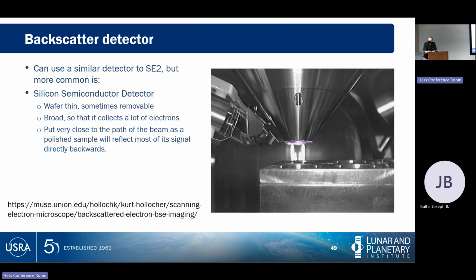But for the same sample, if you need to collect X-ray maps and X-ray point analyses, you need to have a larger working distance. And that's where there is a disadvantage in our SEM, because to change working distance, you have to take the sample back out of the machine and physically lower it on the stage and then put it back in. So it's a good idea to know what you're going to do first when you set the working distance before you put it into the machine. And the machine's smart. If you put it in with a really short working distance and you try to take an EDS analysis, it'll tell you: not at optimal working distance.